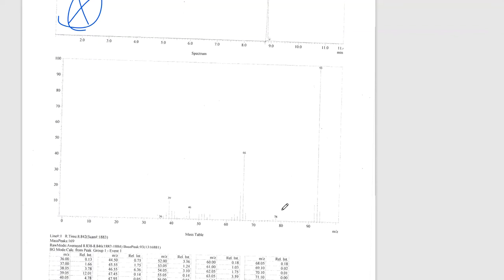I'm sorry that they come off very faint like this. It could be a little bit hard to see, but that particular day when the printer was printing, it just wasn't very, very dark. It needed a new inkjet printer. But I think that it's doable. I think that you'll be able to view these without a problem.